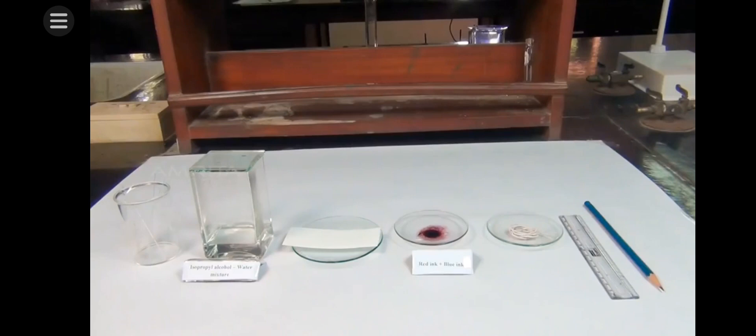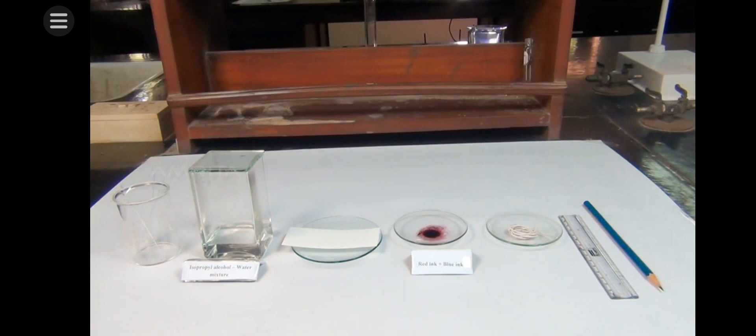When a mobile phase is moved over the mixture on the stationary phase, the components of the mixture gradually are separated from one another. Our aim here is to separate the components from a mixture of red and blue inks by paper chromatography.